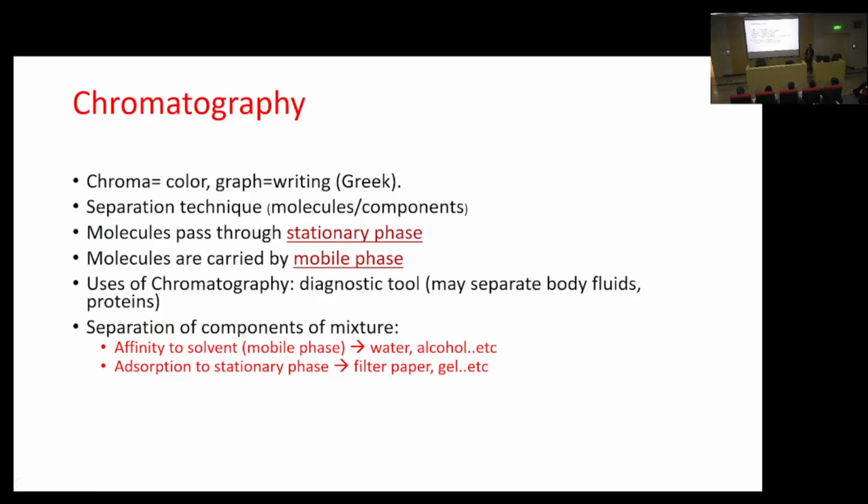It is a separation technique. And chroma is a Greek word that means color, whereas graphy means writing. So when you combine them, that's what it is. But essentially, it is a separation technique whereby you can separate molecules, or different components. And if you want to separate things, it means you understand the real composition of a given solution. You can understand that this can have a lot of applications.